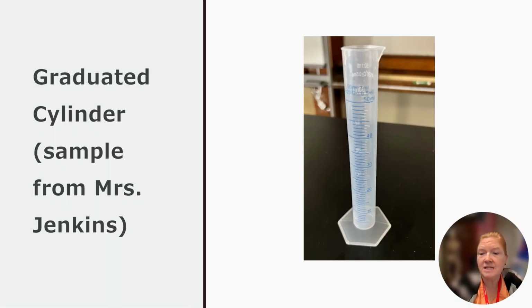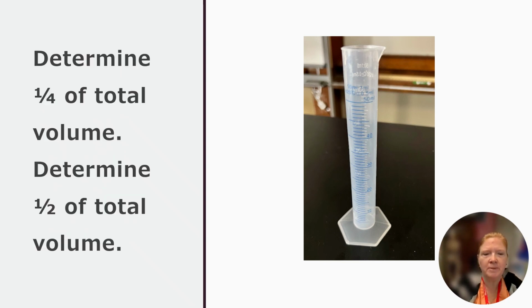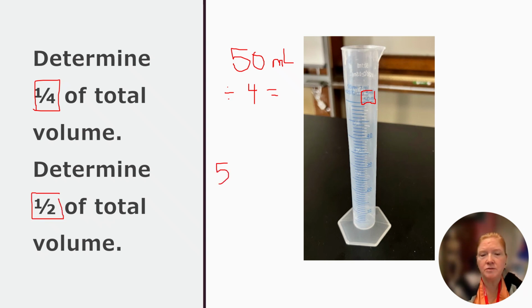Okay, the graduated cylinder, here's a sample that I'm using for this lab because you're going to use one a little different, but I want you to see the process. First, you're going to determine a quarter of the total volume and then a half of the total volume. The graduated cylinder I picked has 50 milliliters max. So to find a quarter of the total volume, I'm going to do 50 divided by 4 and write that on my lab sheet. To determine half of the total volume, I'm going to do 50 divided by 2 and record that on my lab sheet.